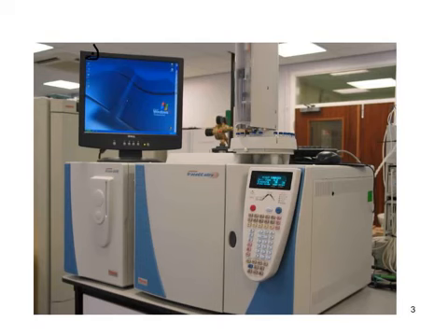Also, the benefit of linking the mass spectrometer or any spectrometer device to a computer is that the computer can have a database of data from literally thousands of different chemicals. And of course, once information is fed into the computer about the current sample, the computer can look into the database to see if it can recognize the data as something that it already has in the data bank. And such a computer then could perhaps feed back information about what it would appear to be.